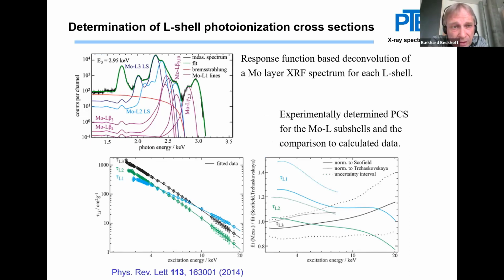In the upper left side, you see the way we do a spectral deconvolution.